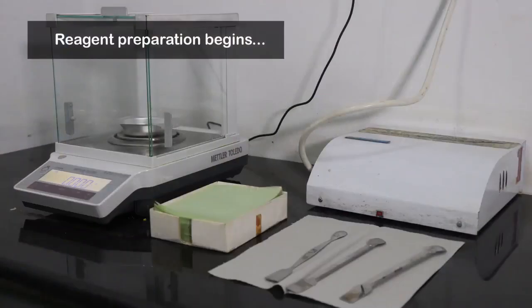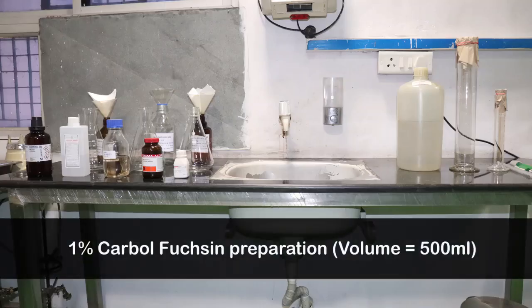We will now begin reagent preparation. Use clean spatulas to weigh, and for ease in mixing, always use glassware double the volume that is being prepared. Carbol fuchsin solution is prepared by dissolving basic fuchsin powder in a phenolic solution.